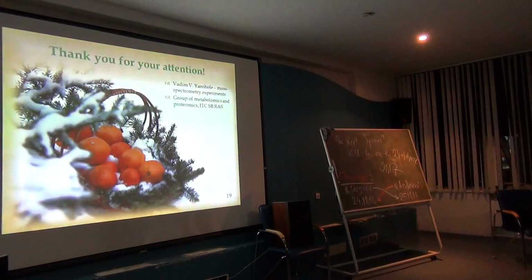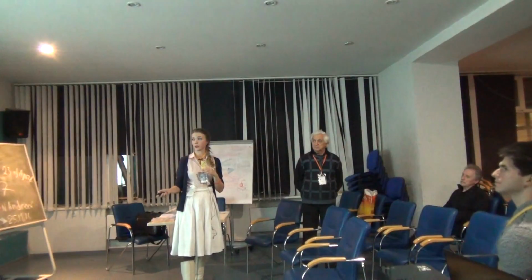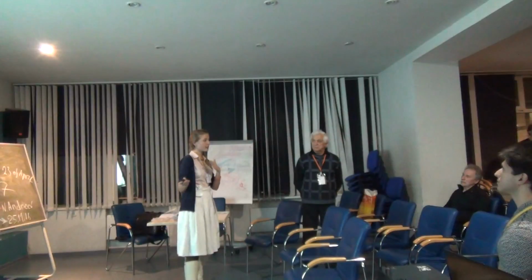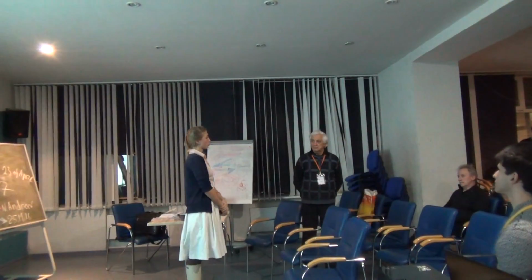Выводы обоих методов совпадали? Мы не оценивали количественные результаты по масс-спектрометрии, так как это гораздо сложнее делать. И тем более мы хотим дальше сравнивать с in vivo данными. Поэтому нам необходим ЯМР для того, чтобы проводить то, что я здесь показываю. Здесь можно проинтегрировать это и сделать выводы, может ли in vivo спектроскопия корректно оценивать, когда мы знаем, что in vitro она точная.